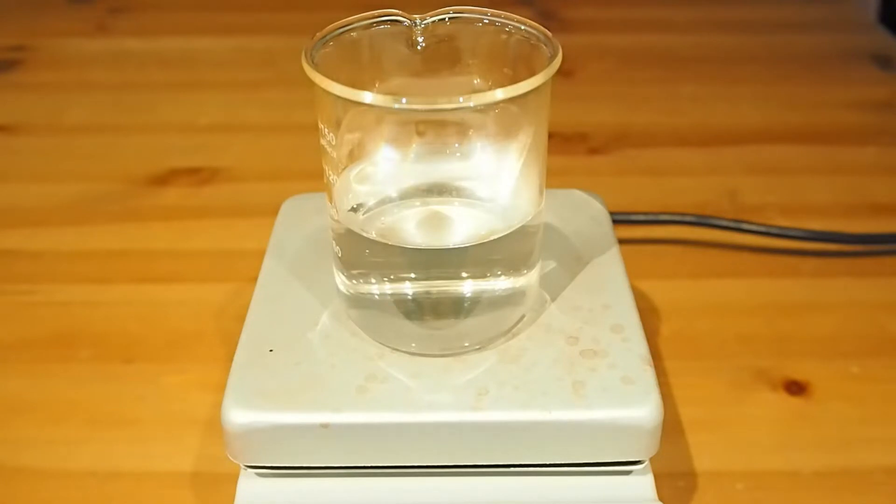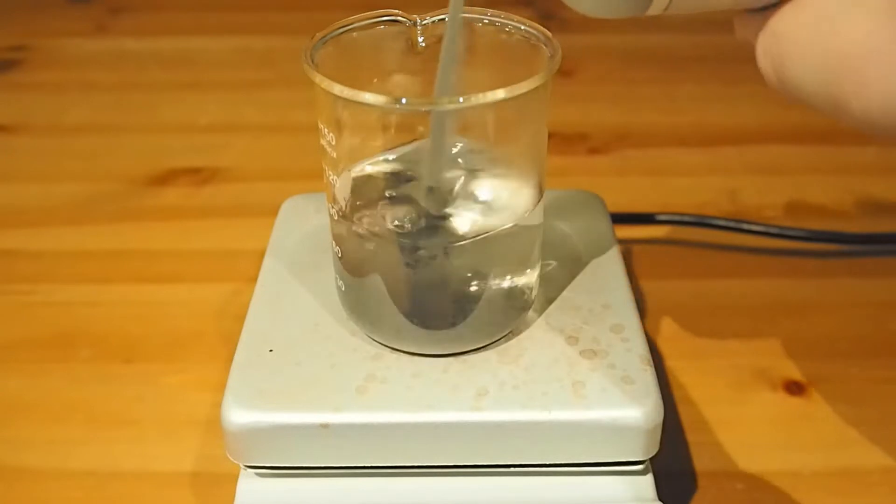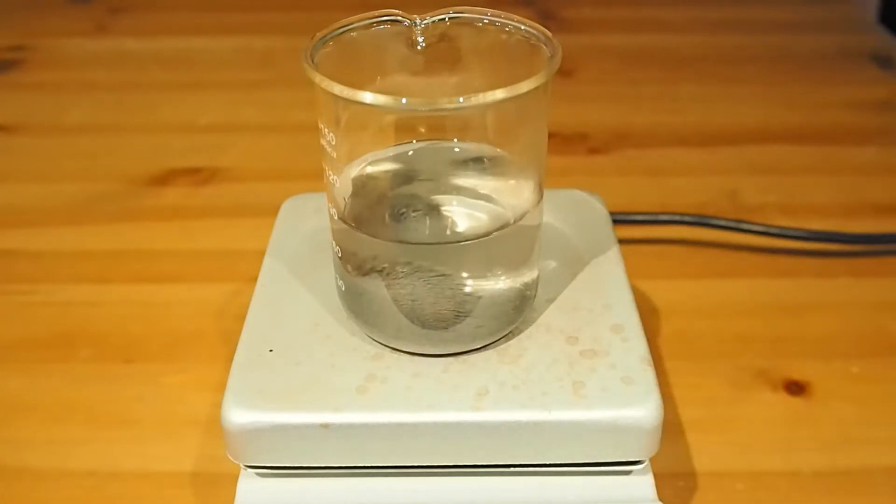So what we're going to do today is try and make some iron sulfate, and it's going to be a slightly different reaction because we're not allowed — in the UK at least — we're not allowed sulfuric acid for home use, so I've got to use a substitution strategy. So I'm just going to put a bit of iron, just an excess of iron in there, plenty of it.